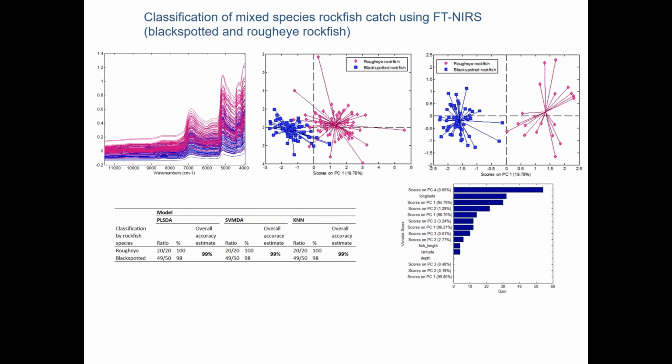Because by and large, there can be a mismatch between the amount of spectra that's collected from an otolith when you scan the entire otolith versus how an analyst identifies, say, the plus group, or whether there is actually much growth at the margin of the otolith. So there is sometimes poor or lack of fit as it relates to the data when that may be ages from otoliths that have been an age added or something like that.